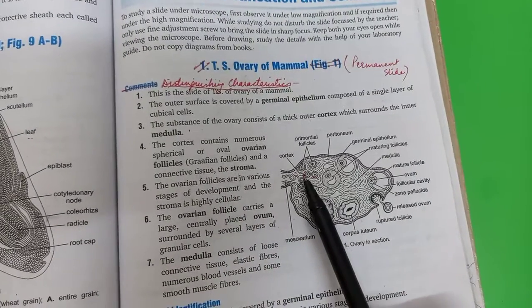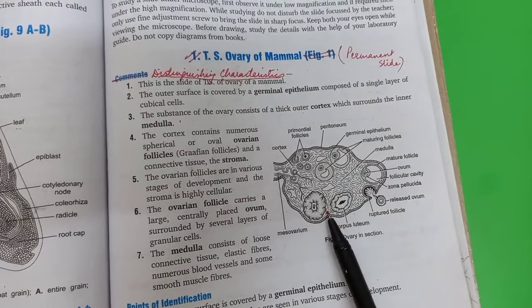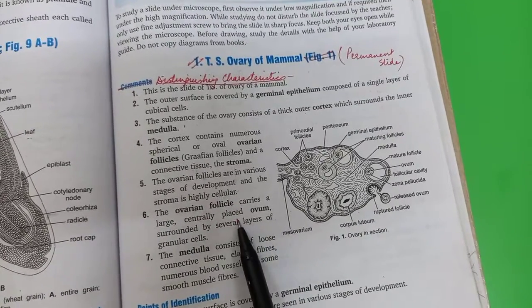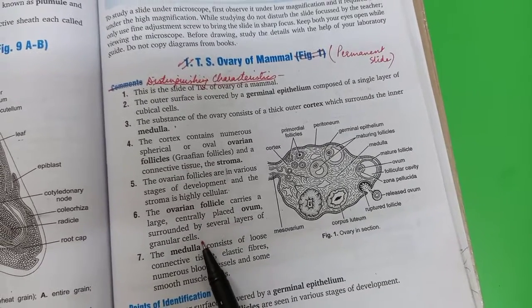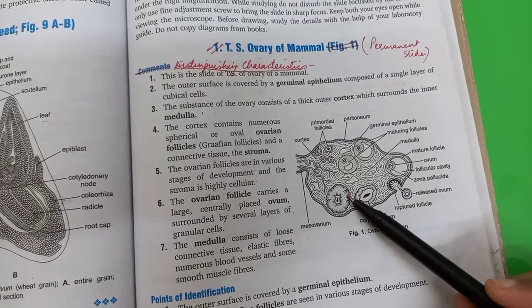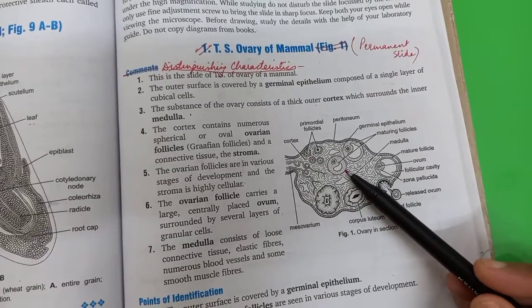You can see some follicles are small, then becoming bigger, in various stages. Then, the ovarian follicle carries a large centrally placed ovum surrounded by several layers of granular cells. One Graafian follicle contains a single ovum and several layers of granular cells, maturing in this manner.